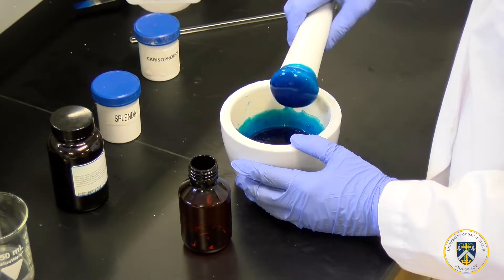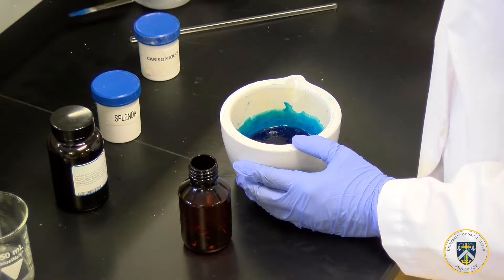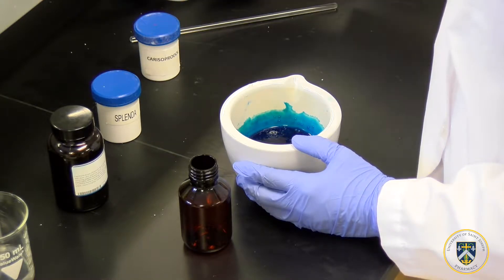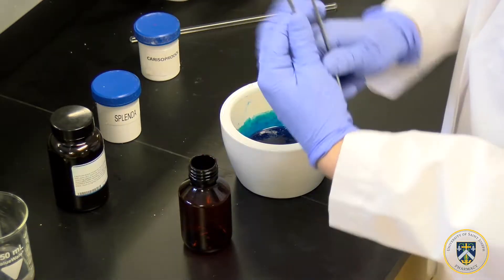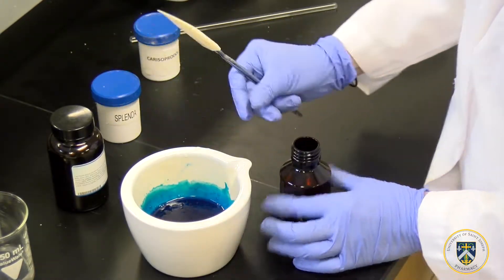Make sure it doesn't drip too much so we don't lose the drug, and using a rubber spatula we are going to transfer this into our amber vial.